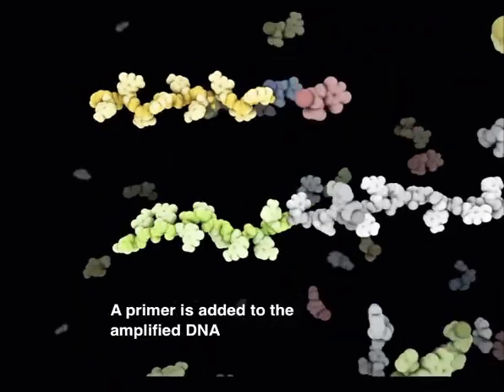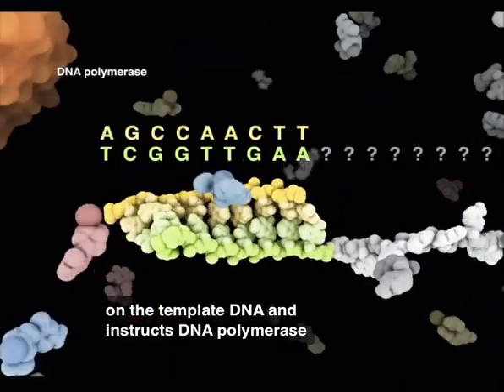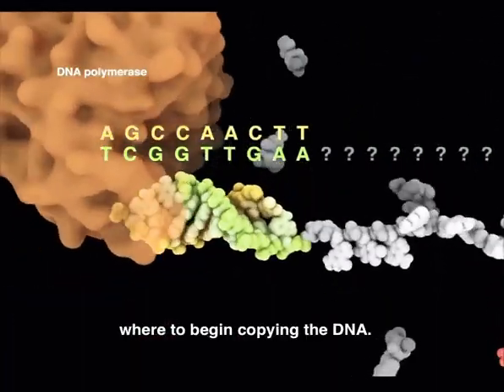A primer is added to the amplified DNA that binds to the complementary sequence on the template DNA and instructs DNA polymerase where to begin copying the DNA.